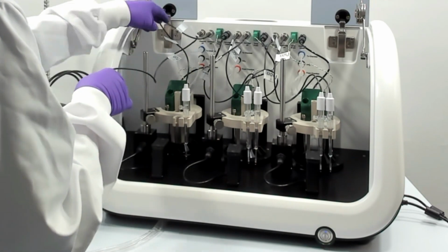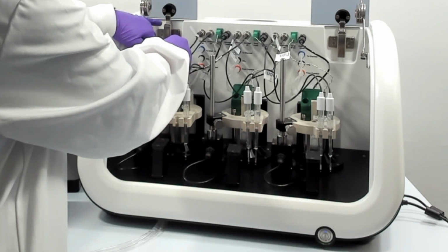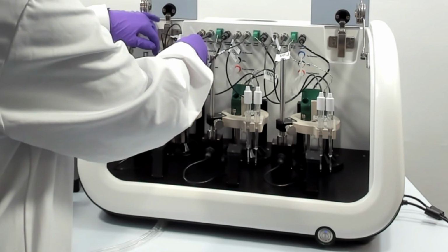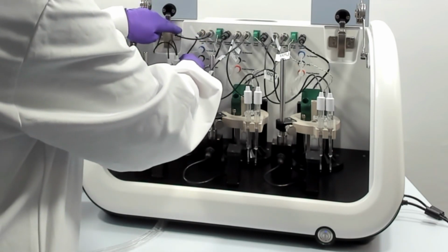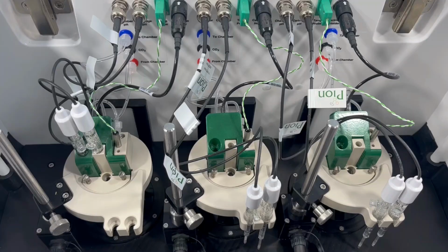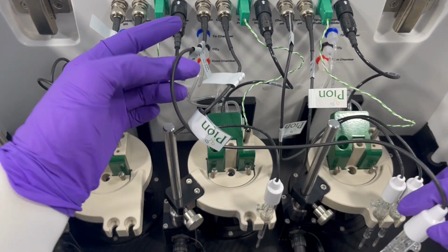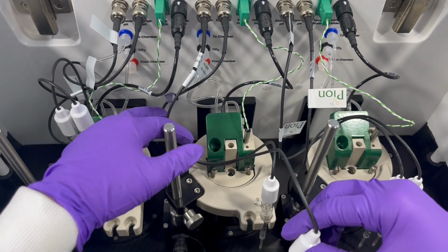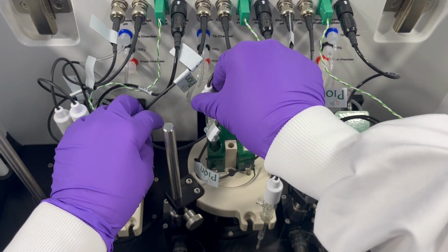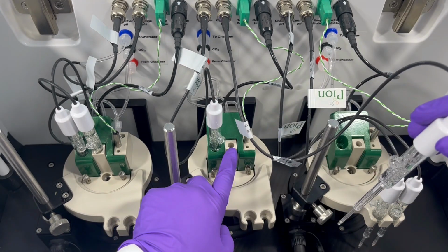So then we need to remove the electrodes and put them in the assay positions, with the chamber electrode inside the cartridge holder in the green section on the left-hand side, and with the cartridge electrode inside the center of the system, reaching into the cartridge. So then if we look from the top, we can see both electrodes in place, as well as the thermocouple on the right-hand side.